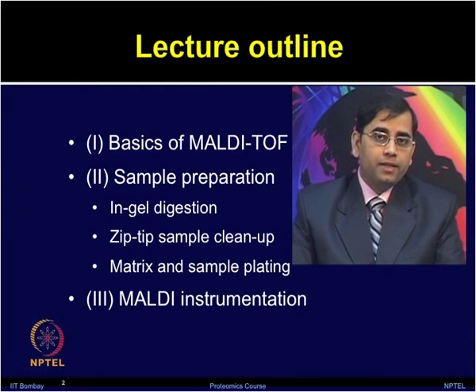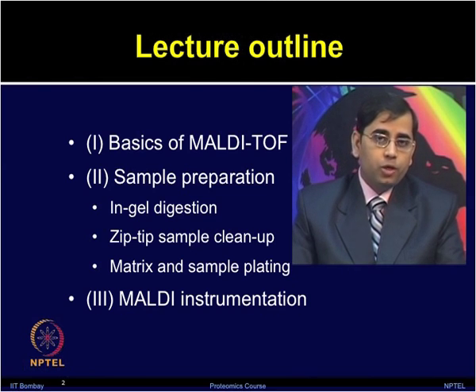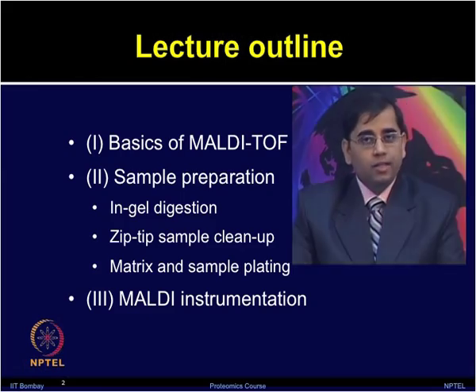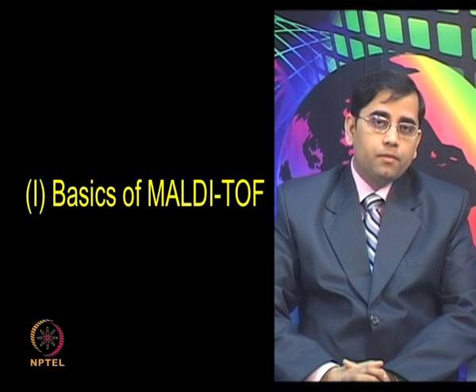You want to do the proteolytic digestion of the samples, followed by a cleaning up step, which requires ZipTip. Then how to prepare the matrix and place those on the sample plate. Then we will talk about MALDI instrumentation. Let us first start with the basics of MALDI-TOF.